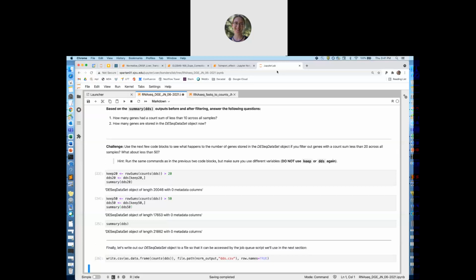All right, so that is as far as we're going to go in the Jupyter Notebook right now. I'm going to go ahead and switch over to the first part of the statistics lecture, to give us some of the statistical background that we're going to need for running and understanding the outputs of DESeq2.